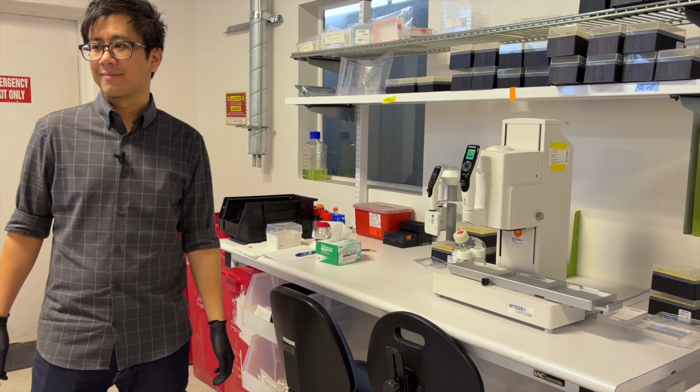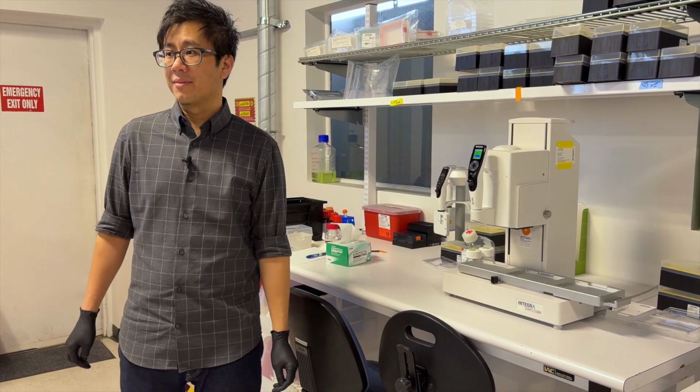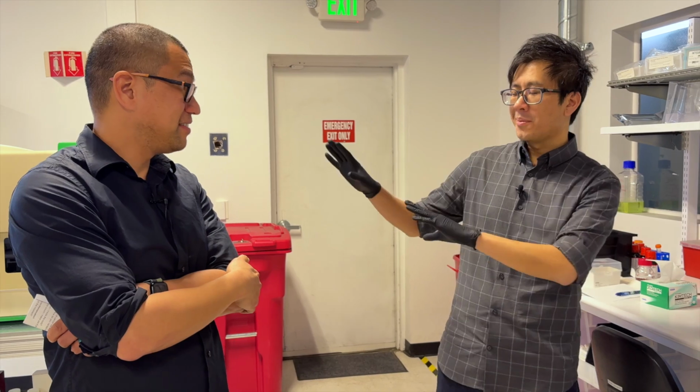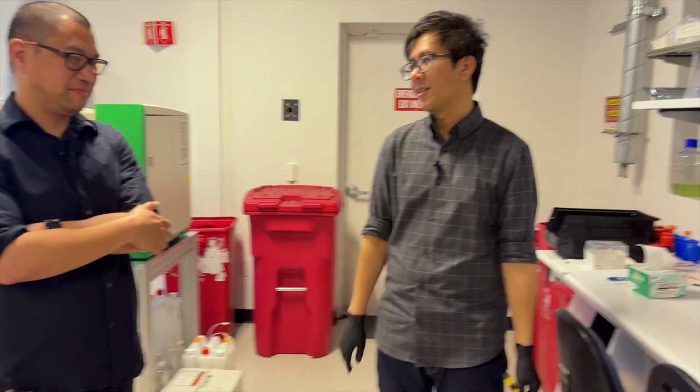Cool, yeah, I often get asked, should we automate the lab or not? And it's this binary thing, but it's like a whole spectrum of options. It's a spectrum, and I think you got to make room for every space in the spectrum, from fully automated, pretty locked down, to highly exploratory and changing every day.